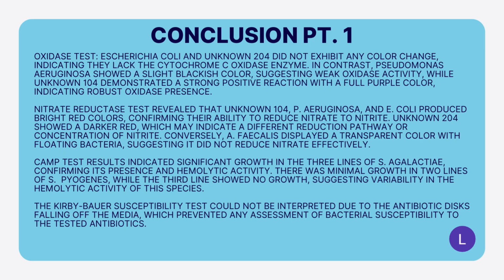Lastly, the Kirby-Bauer susceptibility test couldn't be interpreted due to the antibiotic discs falling off the media, which prevented any diffusion of the antibiotics to the bacteria, which ended up leaving us with no inhibition zones, which unfortunately were not able to be examined.